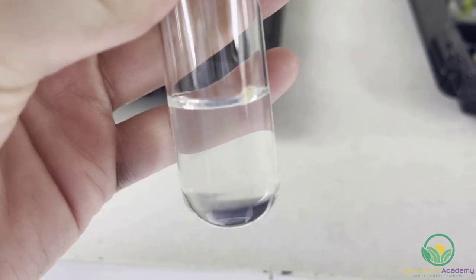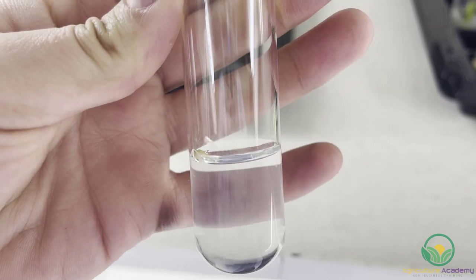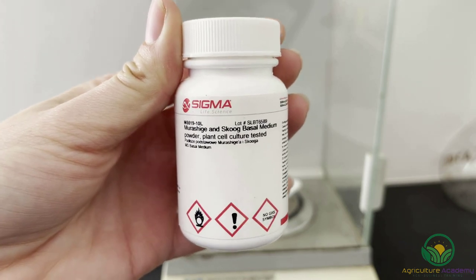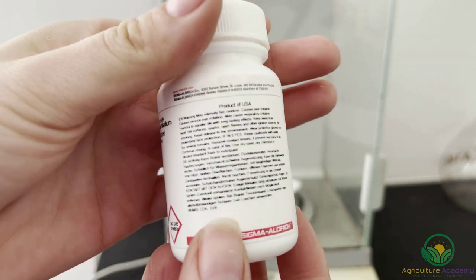Test tubes and any other heat-tolerant tools that need to be used must also be sterilized. The nutrient media used in tissue culture will be specific to the requirements of that plant. Generally, the media will contain inorganic salts and organic compounds such as vitamins, hormones and growth regulators. Commercial companies produce stock solutions so individuals do not have to prepare the medium themselves.